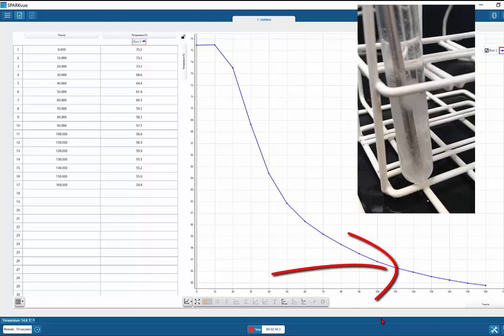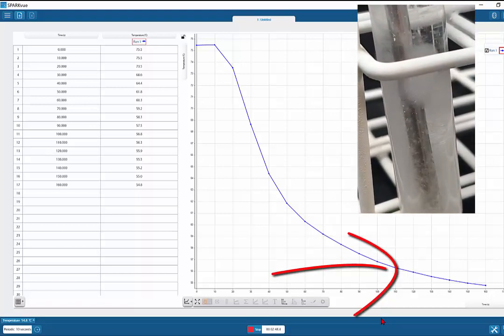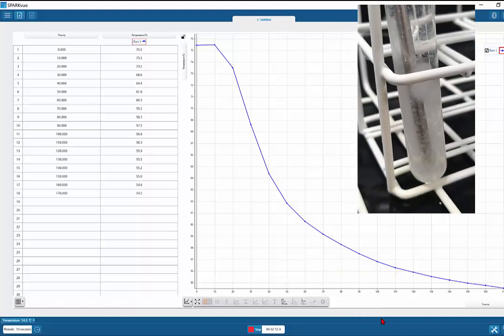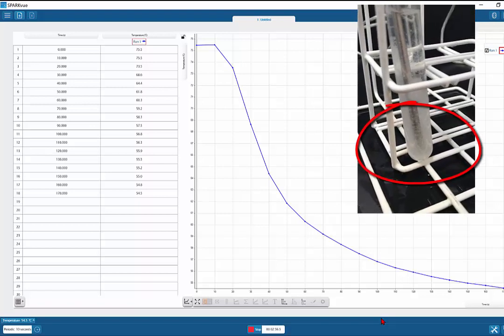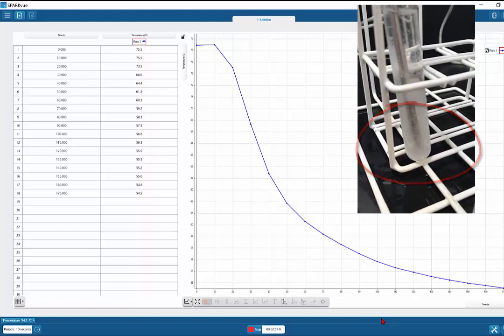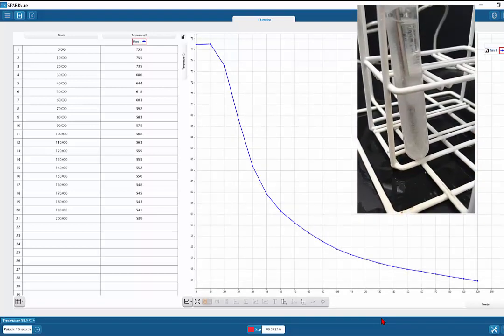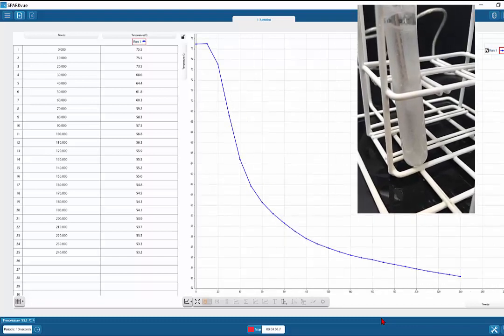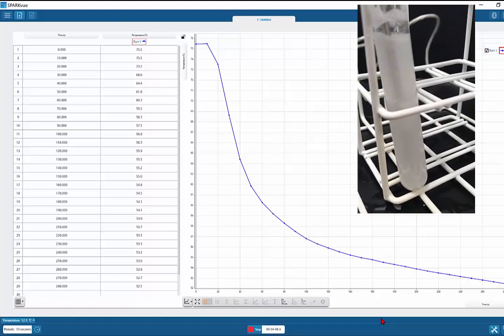Now it's not perfect. There are a few errors in here that you can think about, why it's not just a straight line down and a straight line across, but you can see the straight line across there. Now, all the energy is no longer cooling down. You can see it's going from opaque, from liquid to solid. So all of the energy in the molecules is not about cooling down. It's changing from rolling over to just vibrating, from a liquid to a solid state. That's where the kinetic energy is going.